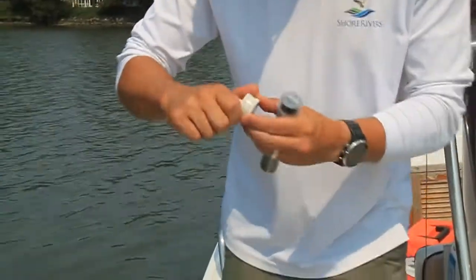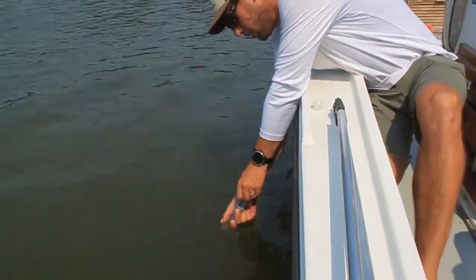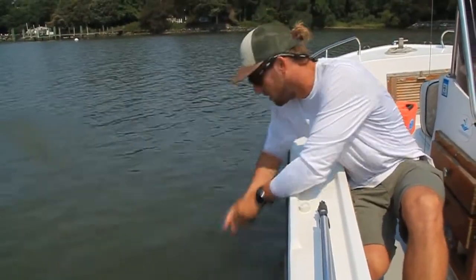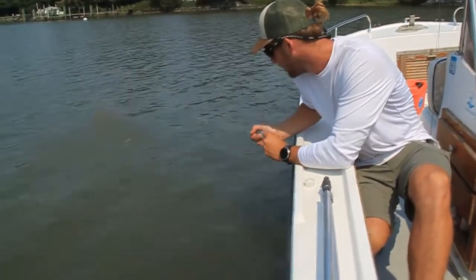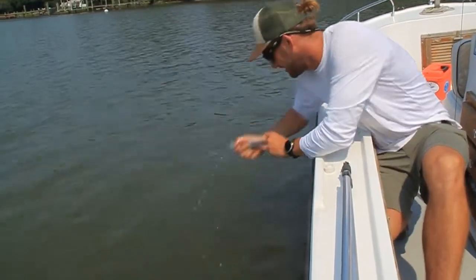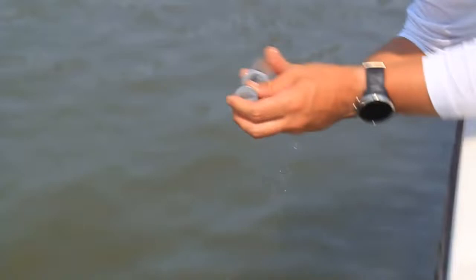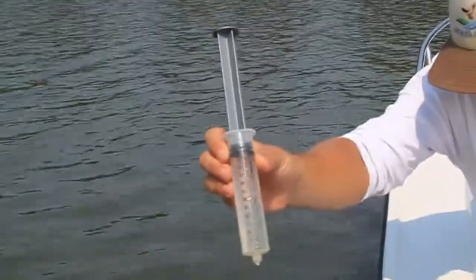And so what we'll do here is we'll secure that filter, go ahead and we'll pull water into the plunger, and just like the nutrient sample, we want to rinse this a couple times with the water that we're taking from the site that we're taking the sample. So we'll go ahead and do that 3 times. And then on the 4th one here, I'll collect exactly about 60 milliliters is what we want. So I'll go ahead and drop that down. You can see we have 60 milliliters there.